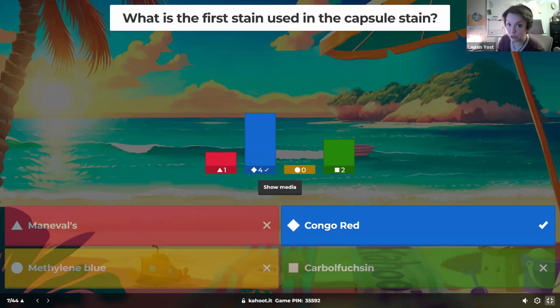They're endospores, is what the structures are, right? And those organized green stained structures will be amongst a sea of red. And those red ones would be the vegetative cells or the sporangiums that are forming the endospores. But I'll just put red cells.